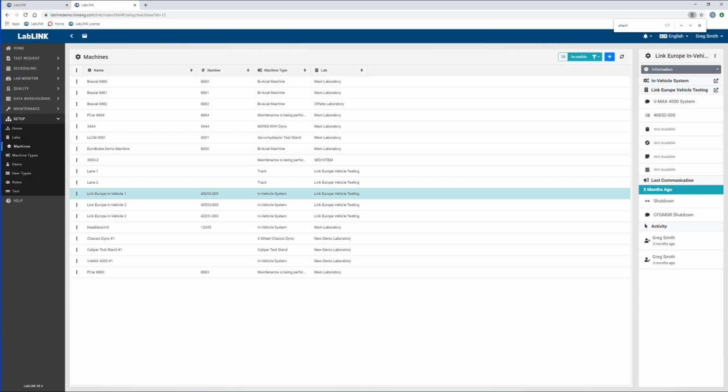Once test data has been uploaded to LabLink, we have a couple of different ways that we can access that test data. This topic will be covered in a later video. This concludes our test request attachments and test data configuration setup demonstration video.